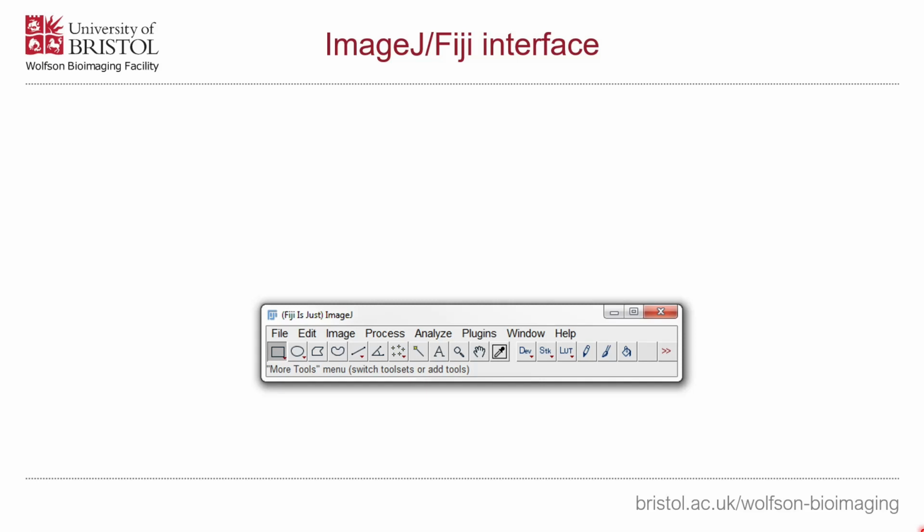There's also a really nice package manager, which we'll look at later on, which allows you to load in any of the hundreds or potentially even thousands of ImageJ plugins which are available and have been previously published. If in doubt, just download Fiji. You can get it from fiji.sc. It's available on Windows, Linux and Mac operating systems.